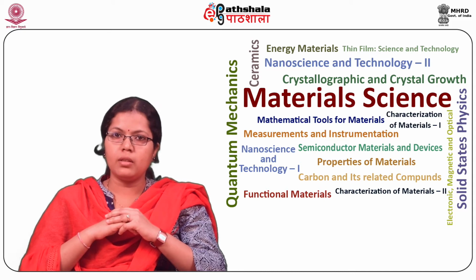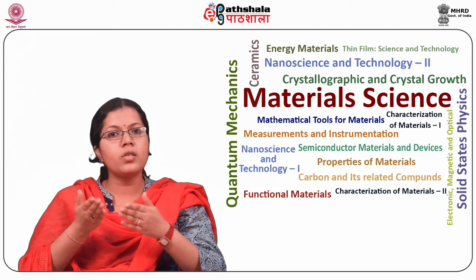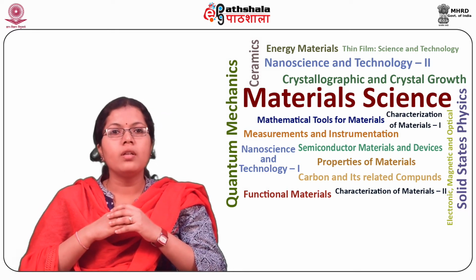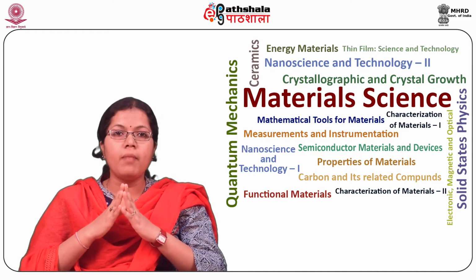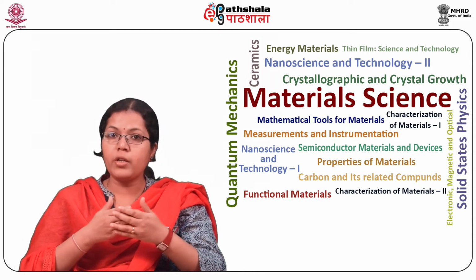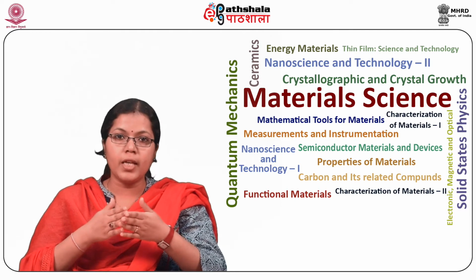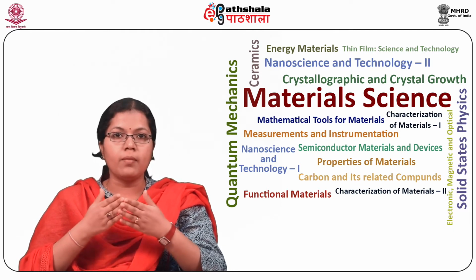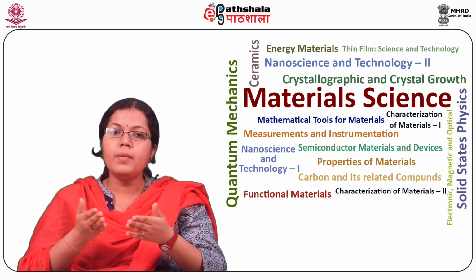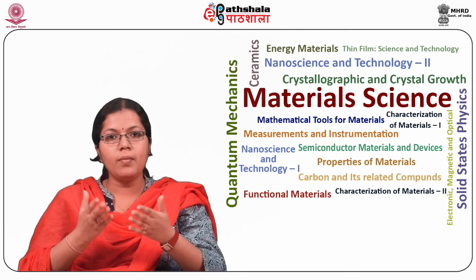The information available may broadly be summarized as morphology, that is, the size, shape, and distribution of phases, and their relationship to one another, with high resolution images varying from micrometer to nanometer level. Then the crystallography: arrangement of atoms and their degree of order, detection of equilibrium and metastable precipitates, orientation relationship. All this can be found out. And the third is the composition, that is, the elements present in the sample and their local variation, and provide a high resolution image.